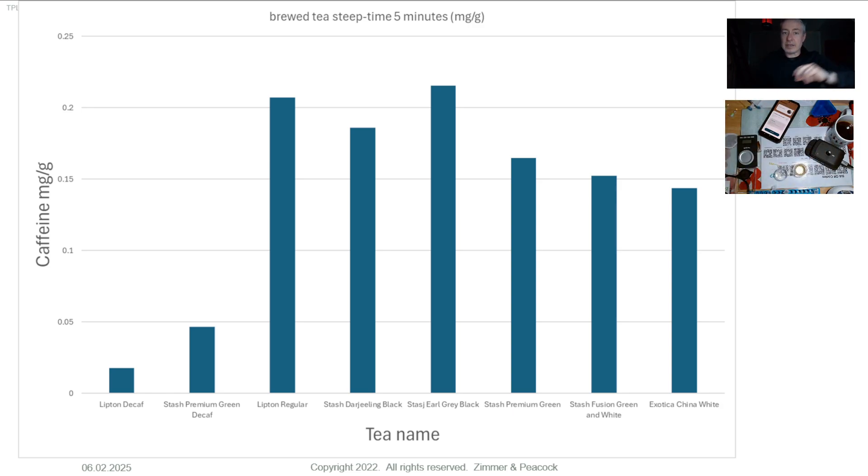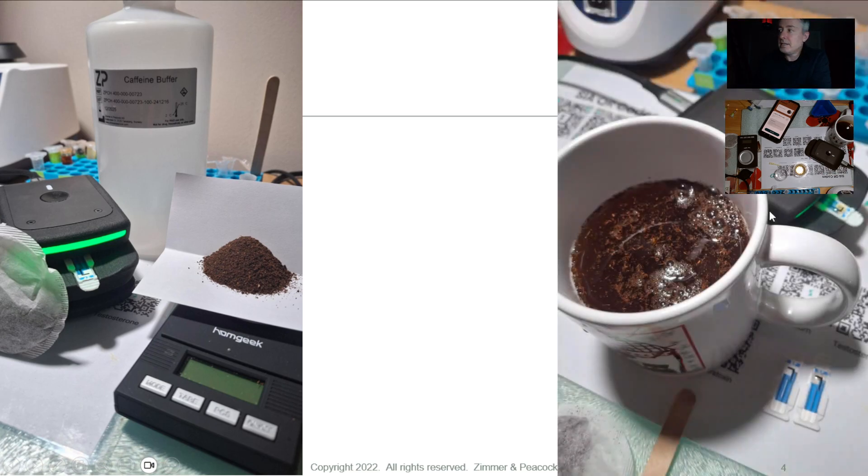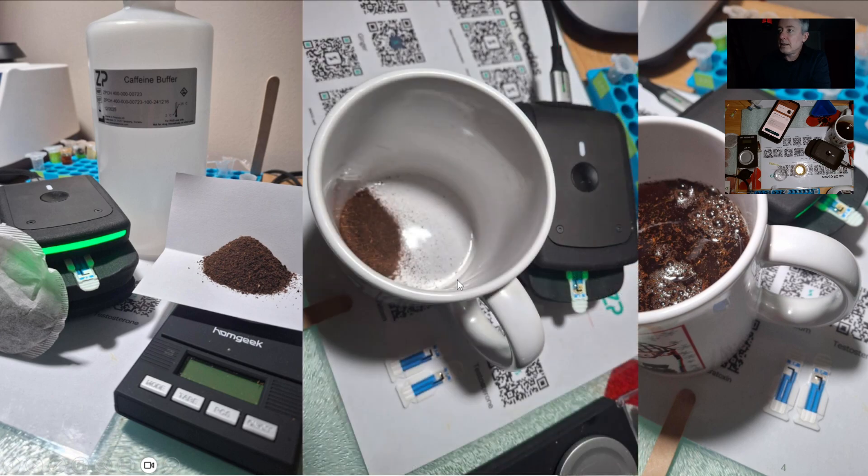This is a live recording. First, I'll discuss how I made the tea: I took two and a half grams of tea and suspended it in about eight fluid ounces — which is about 240 millilitres, strictly speaking 238 millilitres — of boiling water. So I've made essentially a cup of tea, and now I'm going to sample it and measure it.